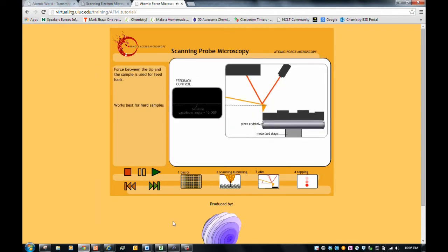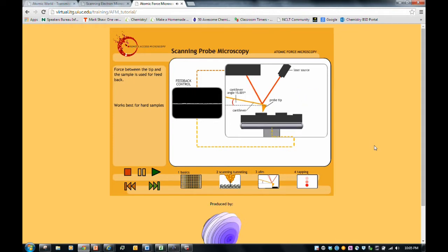Atomic force microscopy uses a silicon nitride tip mounted on the end of a silicon cantilever spring. Feedback is based on a change in force between the tip and the sample, which changes the angle of the cantilever and moves the spring. A laser reflecting off of the back of the tip moves up and down on a detector as the spring moves. The feedback loop reacts to a change in laser position by adjusting the height of the sample in order to keep the force constant. The topography image is created from the path of the sample moving up and down, while the deflection image is based on the deflection of the tip. The AFM operator adjusts the feedback controls to minimize the deflection of the tip.